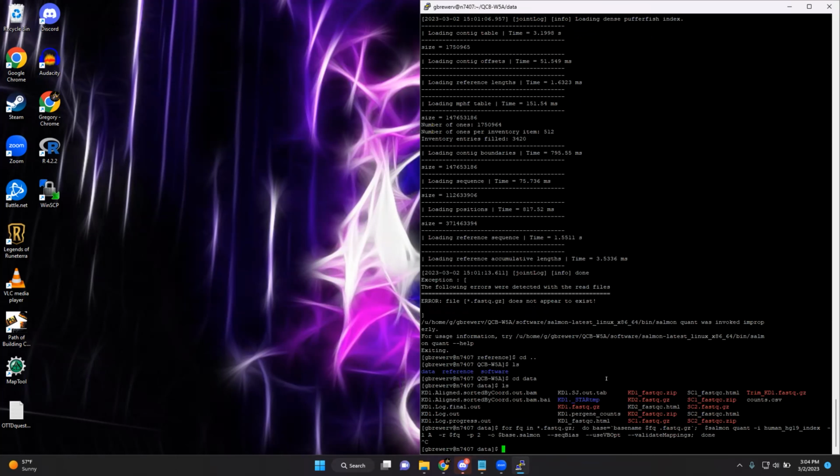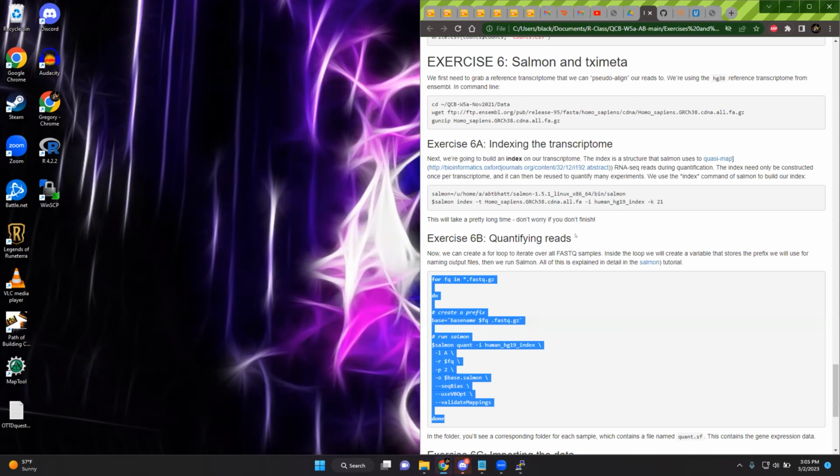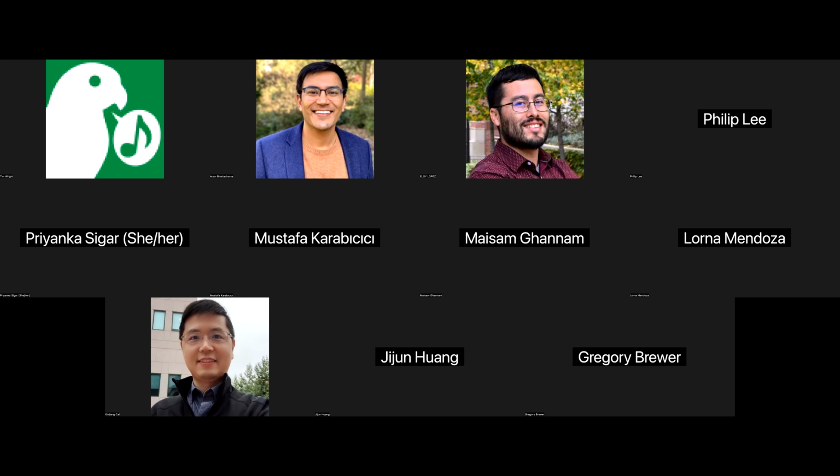All right, so I just need to say what index is. Yeah, so just define another variable for that, in the index equals section. Sorry, give me a second. I can get it from here. Thank you.